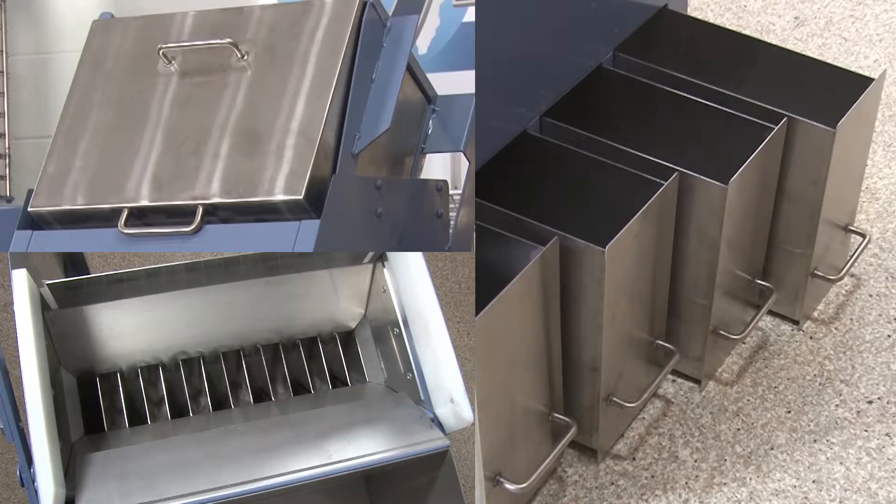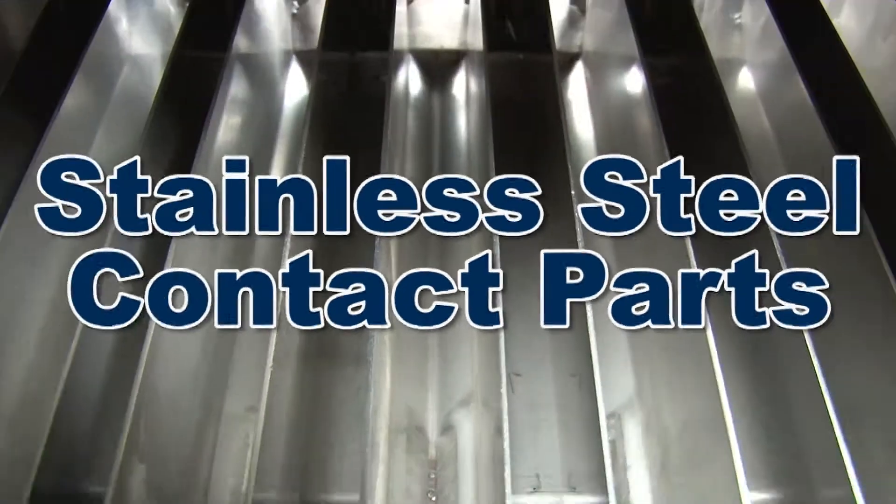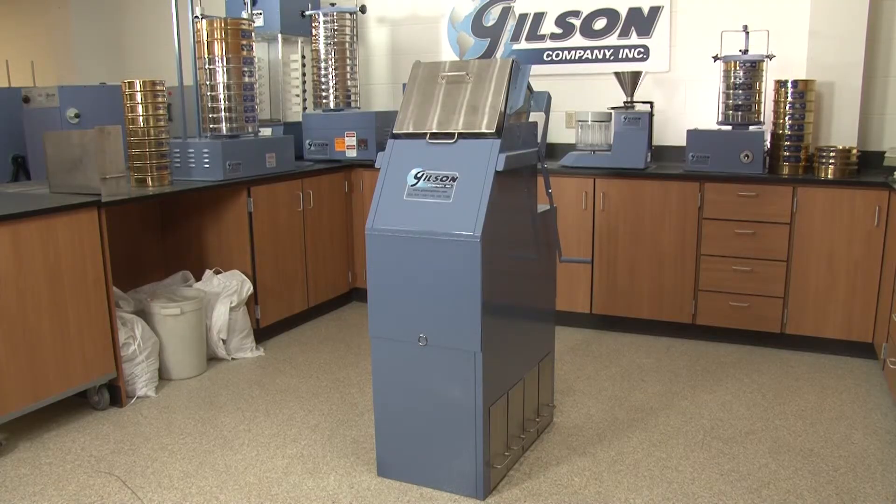The durable SP6 Quadra Splitter contact parts are made of stainless steel for minimal sample contamination, with other parts fabricated from galvanized steel, ensuring low maintenance and a long service life.